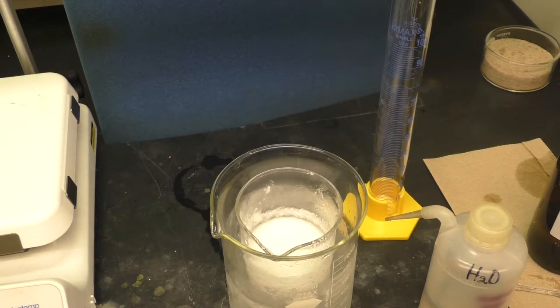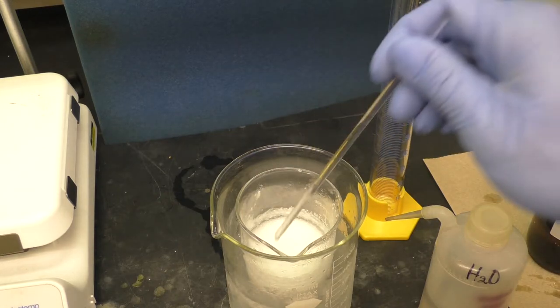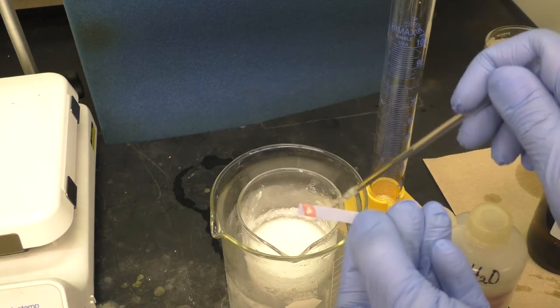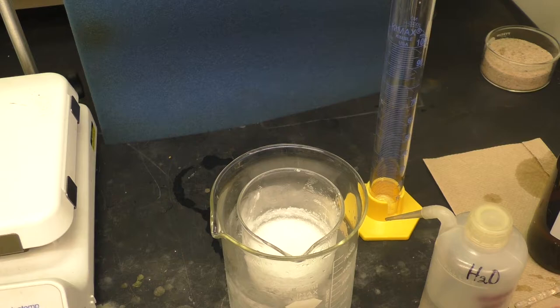Now we're going to test the solution pH, just to see if it's acidic, really quickly using some blue litmus paper. A piece of blue litmus paper here. I'll take the glass stir rod, dip it in the solution, touch it. Oh, and what we see is definitely a clear change to pink. This is definitely acidic. There should be no base remaining at this point. And we're now all set to take this over and collect the solid by filtration.